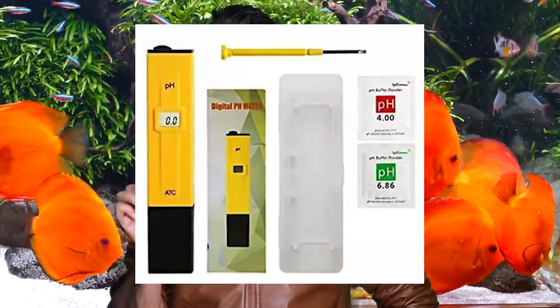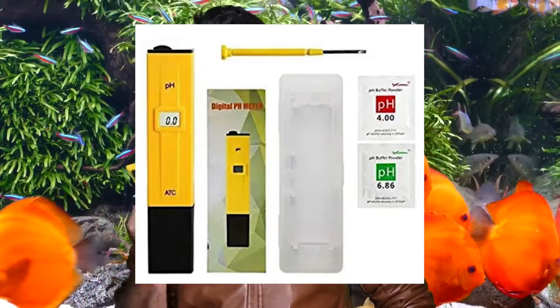This pH meter is about $7, which is entirely reasonable. We will also use 3 buffer solutions, which are 6.86, 4, and 9.18 pH readings.